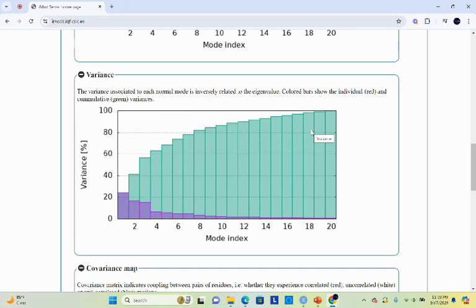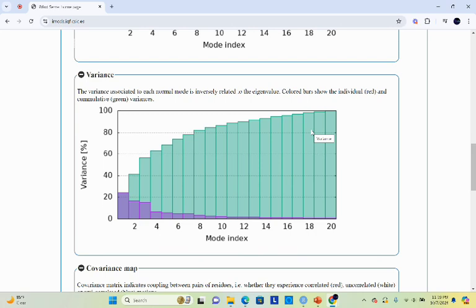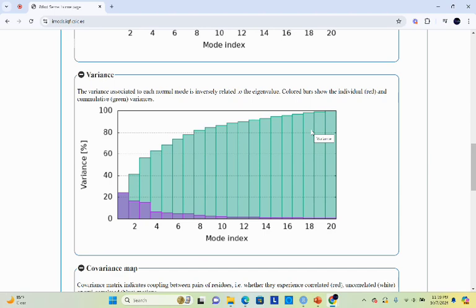Variance shows the fluctuation of atomic position during the simulation. It is calculated based on the eigenvalues and it indicates how much a particular mode contributes to overall flexibility of the protein. Higher variance indicates that the specific mode contributes significantly to the overall flexibility of the protein. Regions with higher variance are more likely to undergo conformational change. However, low variance suggests that the mode has little effect on the flexibility, indicating stability in that region.